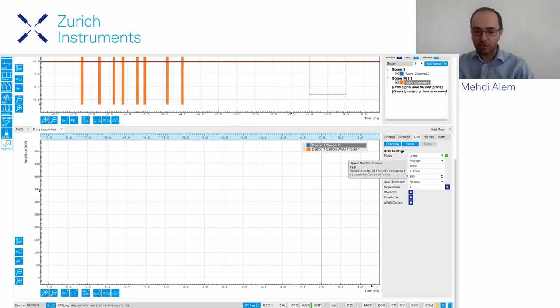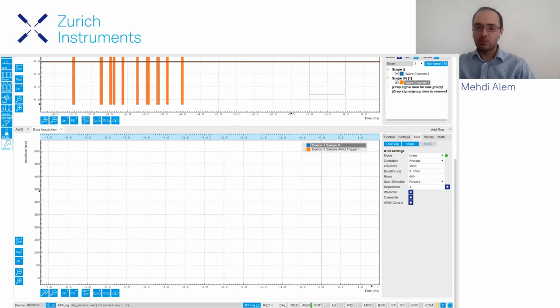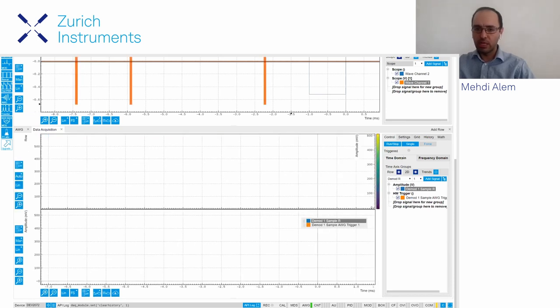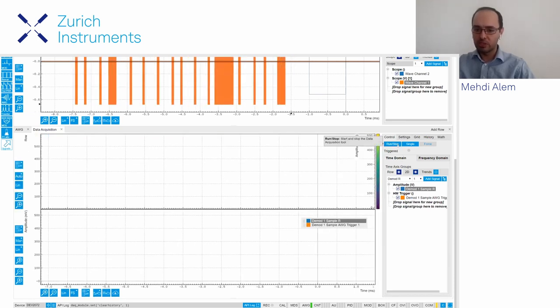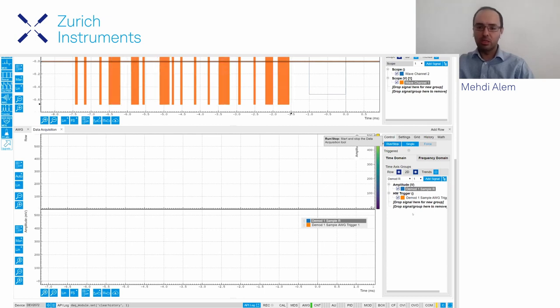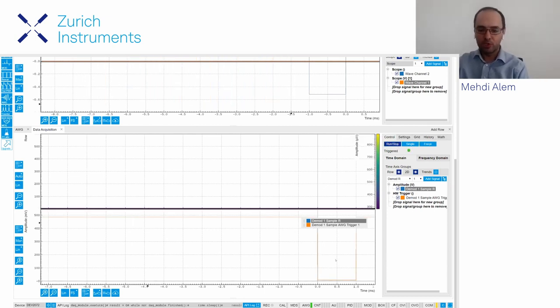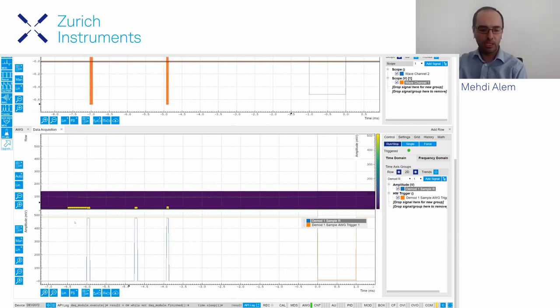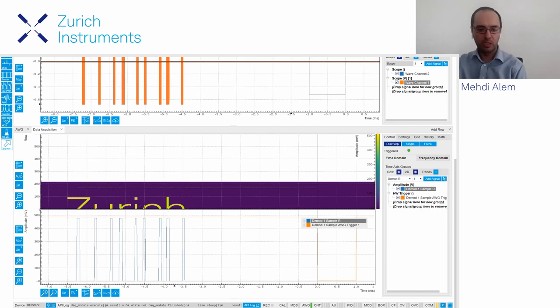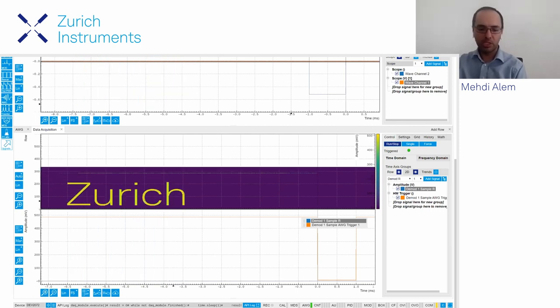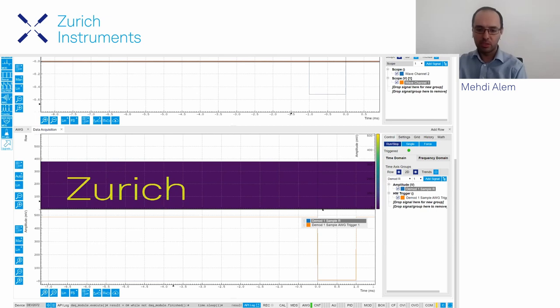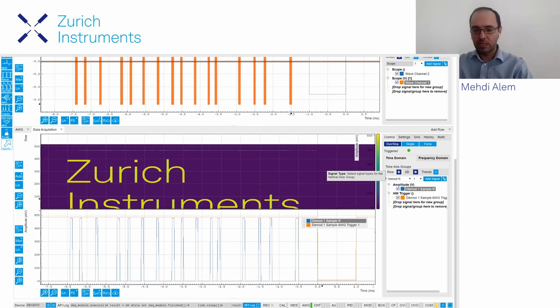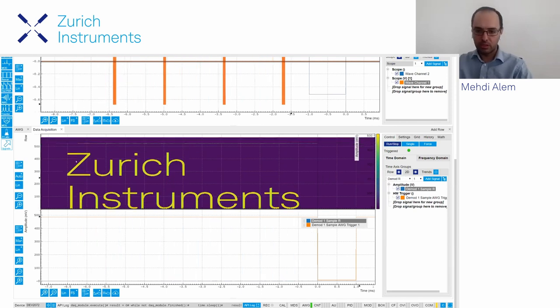Let's see what the measurement looks like if I activate the two-dimensional mode and start measuring. For each trigger it stacks all the lines on top of each other, and when you receive a signal you see the image being built based on the trigger. That's how you can acquire an image using this data acquisition module in the graphical user interface.